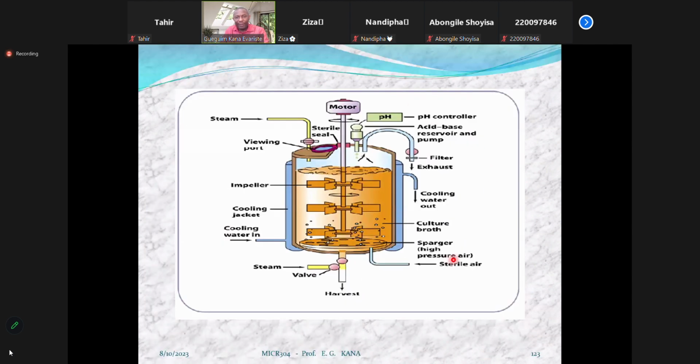Now, further, it's almost the same scenario here. You're going to have the mixing shaft, you're going to have the jacket. Well, in some reactors, you may not have the jacket, but may have other methods to control temperature. You're going to look at, for example, the heating or cooling finger, right? You have the heating part. All these are other methods to adjust temperature. The same configurations, the same components, are reflected in this other system.